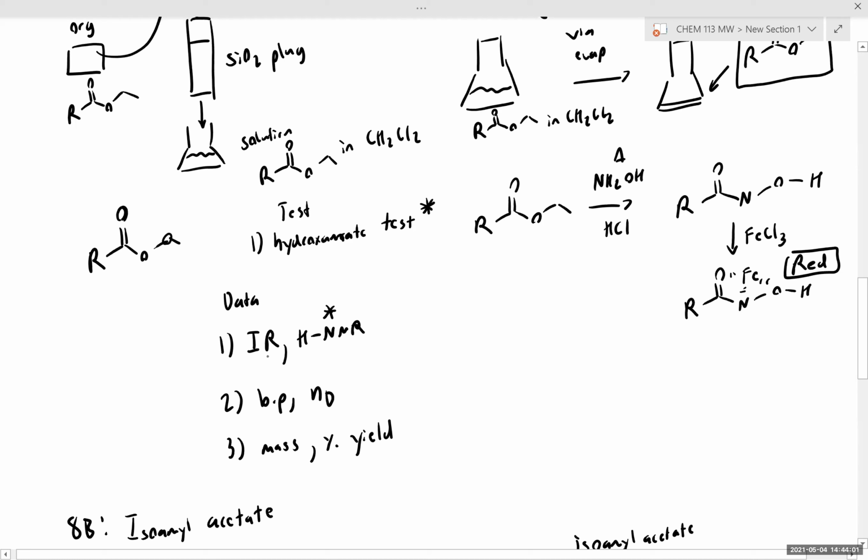We're also going to be looking at the infrared spectra, which will provide evidence, because if you look at the carbonyl carbon as well as the carboxylic acid OH stretch, those are quite definitive clues for whether or not you've generated the ester product. We're also going to take a proton NMR, and you can look for these ester protons, which are highly indicative for the ethyl laurate product. Finally, we're going to take a boiling point and refractive index of our product, and then we'll calculate the mass and percent yield based on the isolated mass.